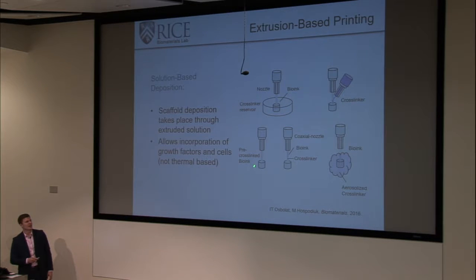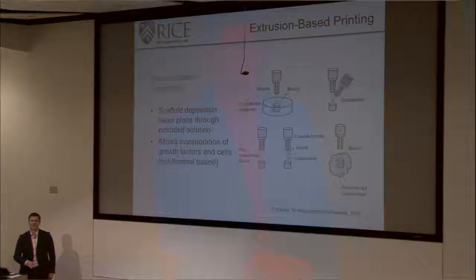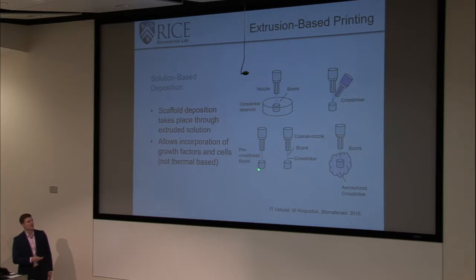Similarly, you'll find that in some of our discussions later, it's really important that we figure out how we make this bottom layer adhere to even just a dry dish. So that's something that a lot of people, when they're jumping into 3D printing for the first time or getting to their scaffold, don't consider at all. And then it turns out to be a huge challenge because you've designed the material, you've designed the bioink, you think you've got perfect compatibility, you've got the cross-linking agent, but nobody considers that first layer anchoring, and then all that work you've done is for nothing. So if you haven't used 3D printing yet, and you're planning on using a hydrogel or some other type of biomaterial in extrusion-based printing, I strongly encourage you to consider how you're going to get that first layer to stick and how you're going to get that first layer to stay in place.